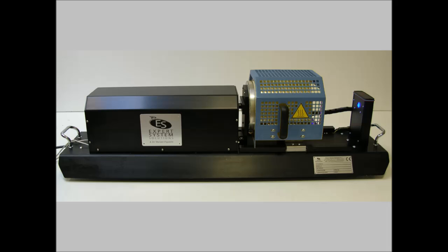The heating microscope MISURA HSM-L is the ideal instrument for all applications which do not require very high heating rates or very high temperatures, like in the field of second firing decoration on ceramic ware or glassware. Another very interesting field of application is the study of the wetting power of inks or thermoplastic paints.